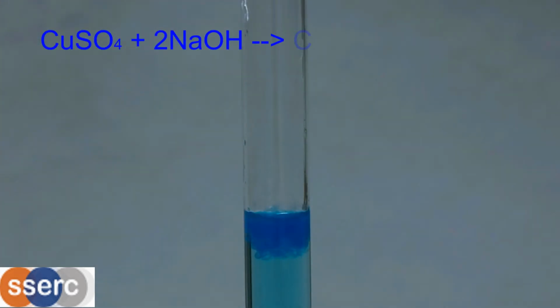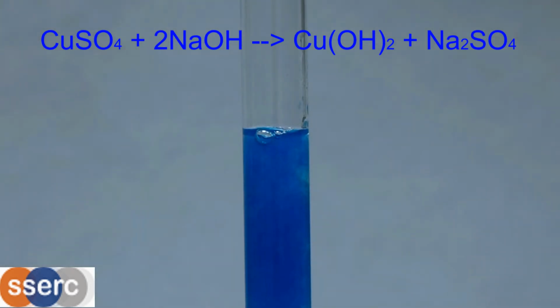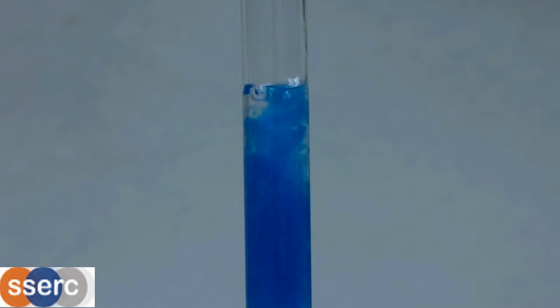We'll start with copper. Now, copper solutions are generally easy to identify anyway, as they're usually blue or sometimes green. As you can see, adding a few drops of sodium hydroxide gives a blue precipitate of copper 2 hydroxide. Adding more just produces more precipitate.